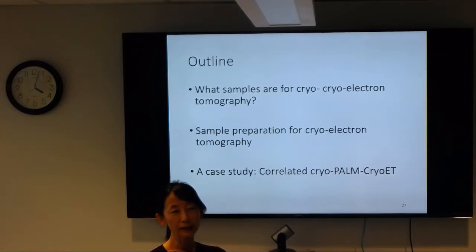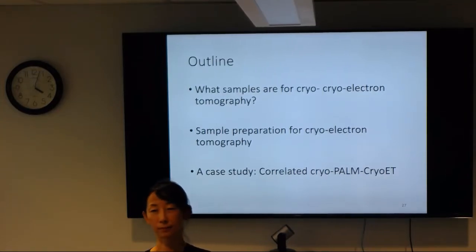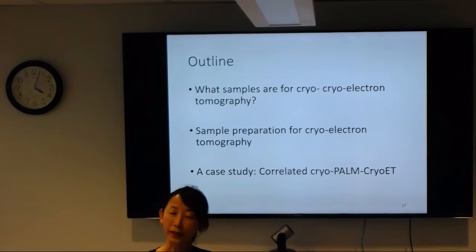If I have a new student, I let him or her use silicon dioxide because it's not as easily broken as carbon film. They feel a little bit sturdier to handle. I haven't used silicon dioxide, but I've used silicon nitride. It sounds similar. It kind of just looks like glass. In my experience, like growing cells on a glass coverslip, silicon nitride grids seem to work about the same in terms of how much coating protein I need and how long they need to go.